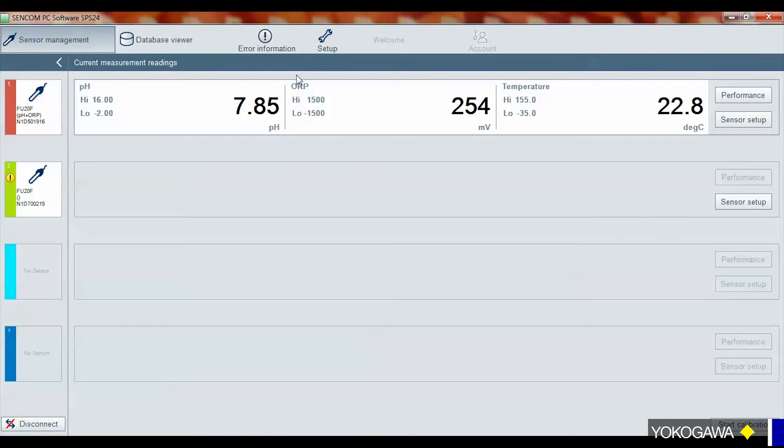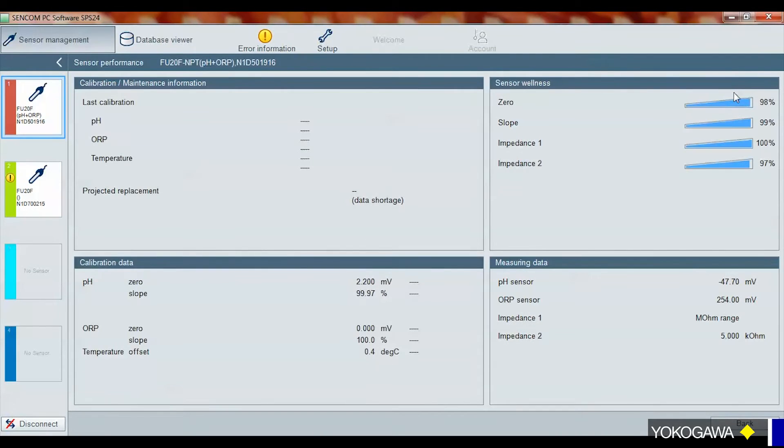Going back to the sensor management side — here you see your one sensor. In here you get obviously what it's reading right now: the pH, the ORP, the temperature. These are live values. If you select performance, you get more information. Right now there's no calibration data for it, but you have what it is currently: the slope, the asymmetry potential, the ORP value slope when you did a calibration, the temperature. And over here you have a sensor wellness — it's kind of like a bar graph like your battery on your cell phone. When it's good it's obviously high, and as it ages it decreases over time.